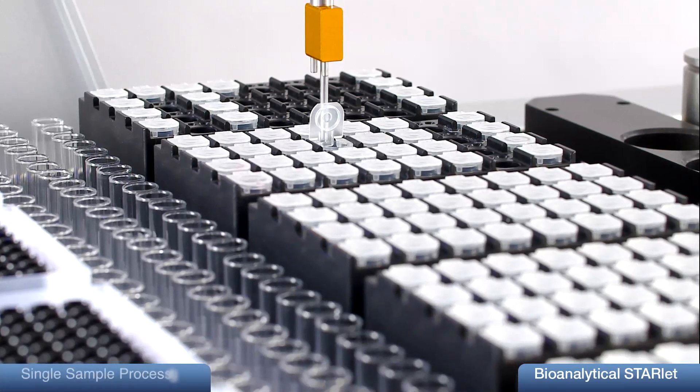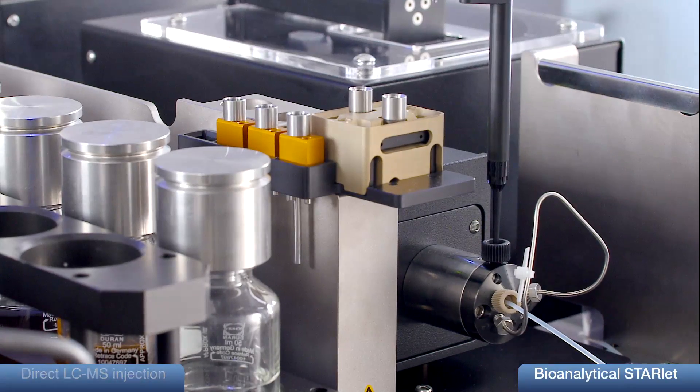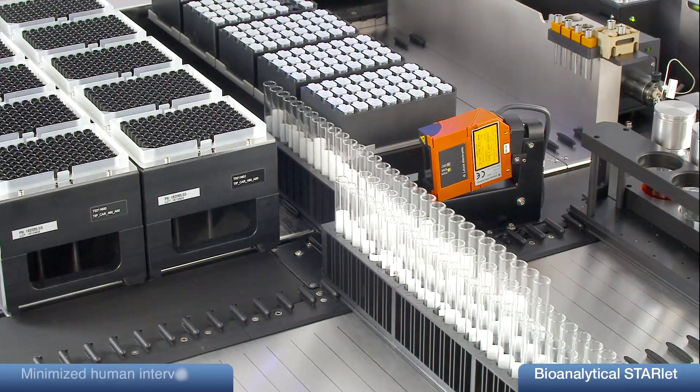It is the only system supporting single sample processing and direct LC-MS injection. It supports full audit trail and is easy to use.